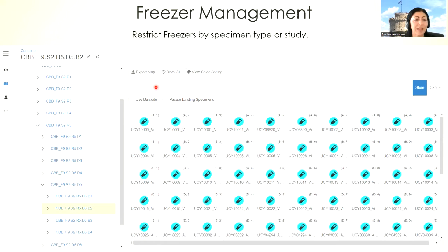The lab technician can, again, very easily store a sample by just clicking in this box and scanning the specimen's barcode. Lab technicians are also able to select a specific position inside the box to store the sample. Also, a specific color code can be assigned to each specimen type. In our case, we have in total 7 freezers with dimensions, 3 storage locations that are dimensionless, and 1 storage location that is a combination of both. Half of it has dimensions and half of it is linear.